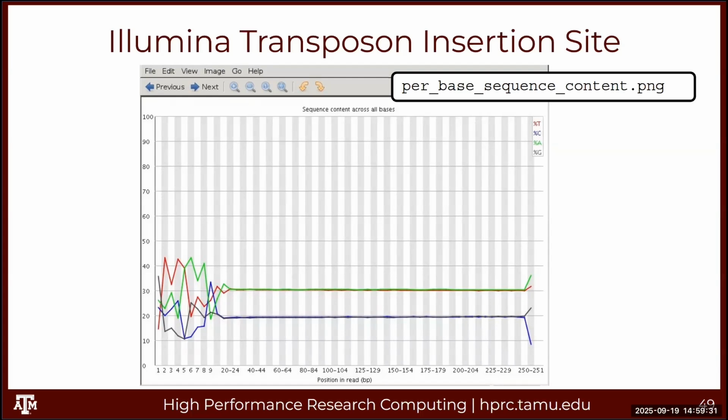So like here, what I want to say is that the next part is giving an accurate result. Does this mean the first one is not giving us an accurate result? The rest of it is perfect. The first part is just skewed towards having higher T and A compared to the rest.